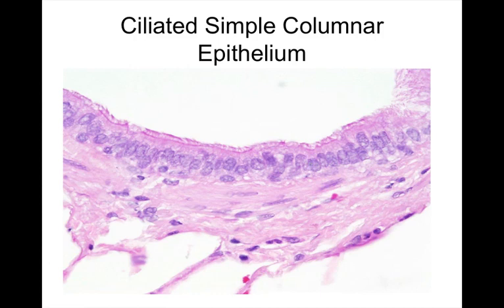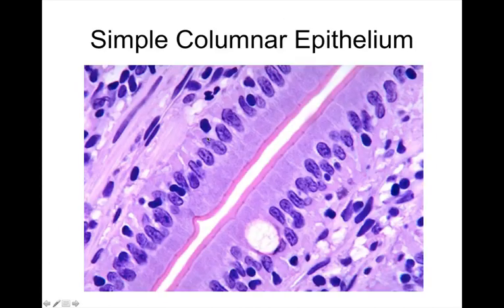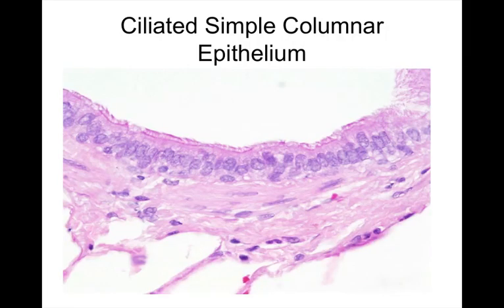Now compare what the cilia look like. Actually, this is a really nice picture of these cilia. They look like little hairs. Yeah, they're definitely more distinct in this picture than the microvilli in the previous one, which is just hazy. Yep, so they're all a blur because they're so thin. But these guys actually have not only some space between them, but they're also a little bit tighter.